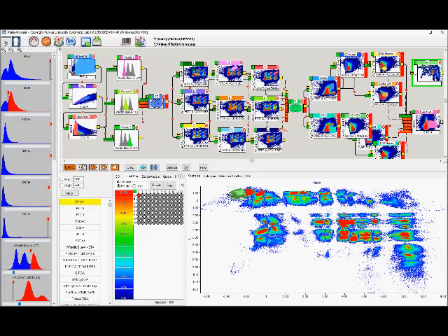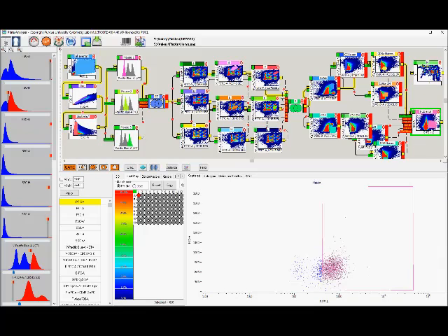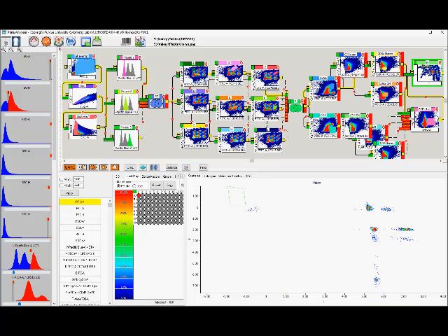Now, what I'm going to do is I'm going to take my right gate here, because this is the reporting for your 6 populations here. I'm actually going to join this up to here. And when I right click this, as I go through these populations, it's going to show me on this map where those individual populations are.